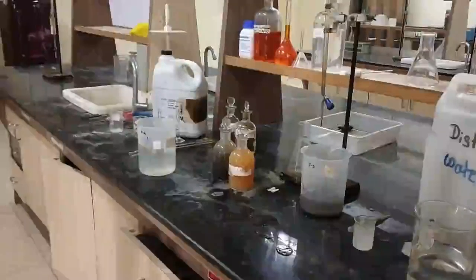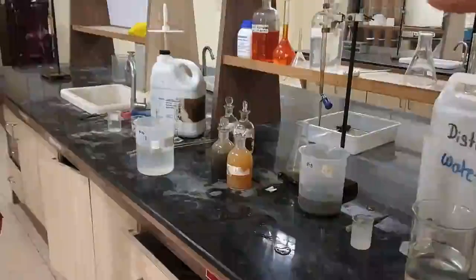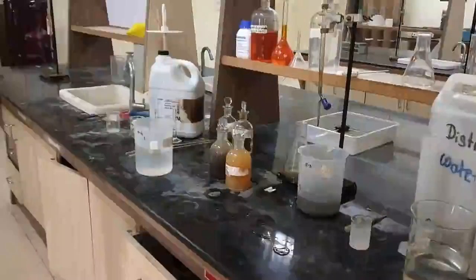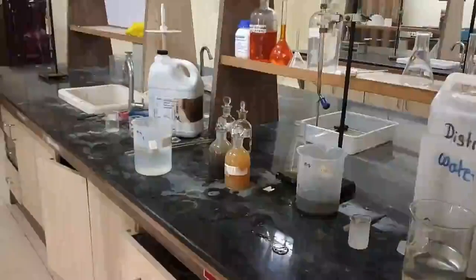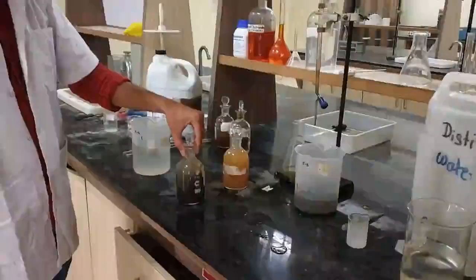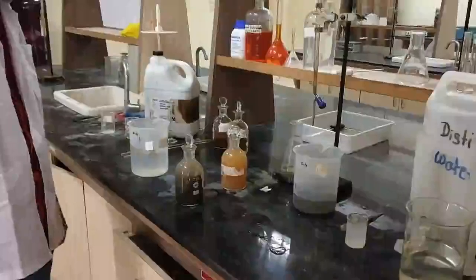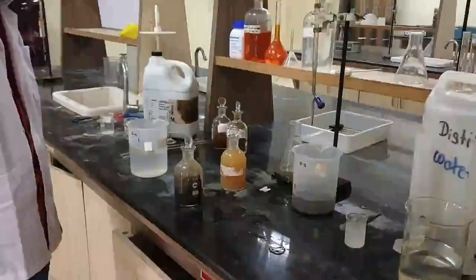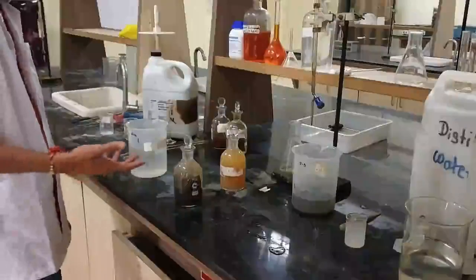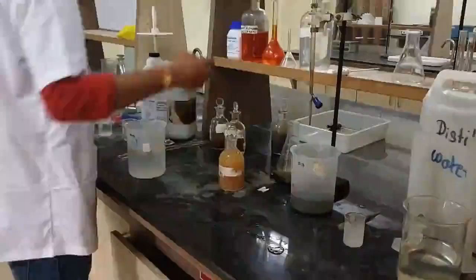So what we are going to do next is that with our first bottle where the white PPT has formed, the DO is absent because we got a white PPT. So we are not going to find out the DO of this bottle, right? We already got the answer. The DO of this bottle is 0 mg per liter. Now we are going to focus on the second bottle for which we have got the brownish PPT, right?